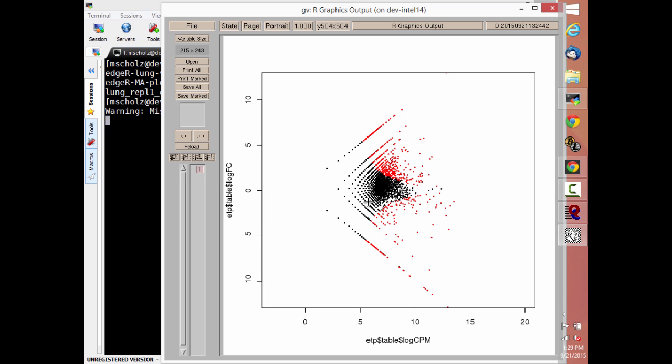I have an interesting point here. If you've got it open, it may be easier to see on your screen. But where the cursor is right now is sitting on top of a little red dot.